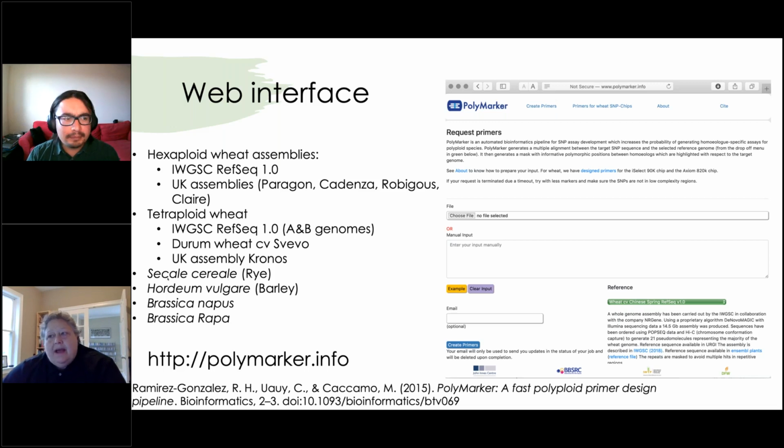Okay. How long can a primer be before adding the tail? So the shortest we use will be 19 bases, but ideally it should be around 21 bases. And I think we have used some up to 26 bases, and still fine. Okay.